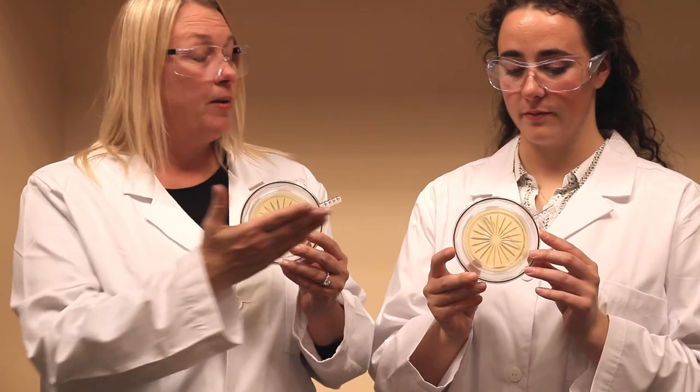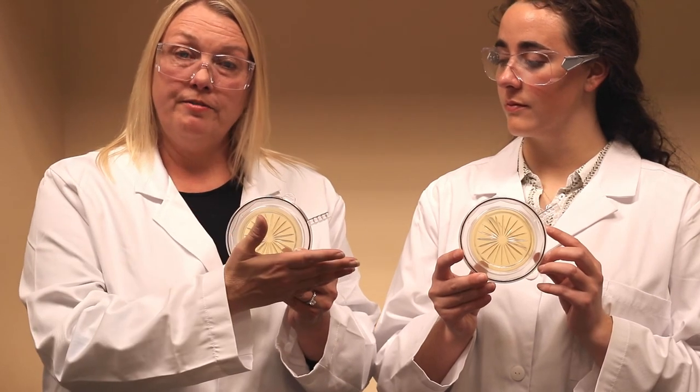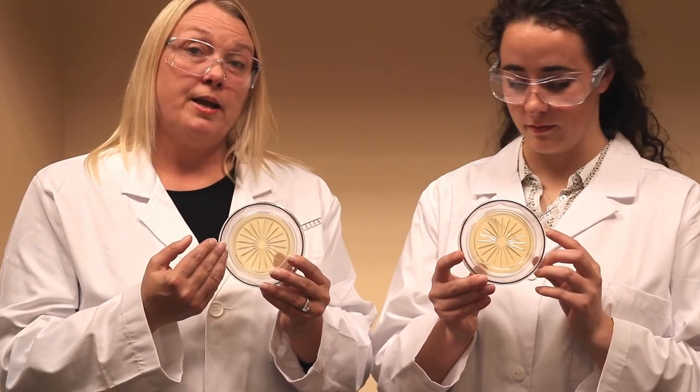These are also good for all vacuum sources of 100 liter per minute. If you don't use Particle Measuring Systems Active Air Sampler, these can be used on an FMS that uses 100 liter per minute, and they can be used with any handheld sampler at 100 liter per minute. The shelf life for both the 25/50 liter per minute and the 100 liter per minute is 12 months from manufacturing.